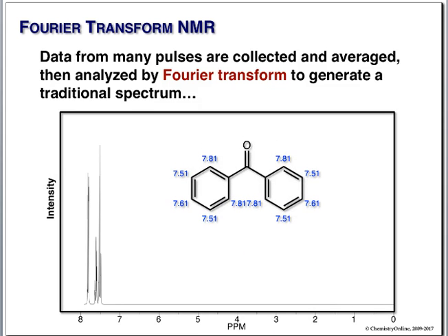These are monosub benzenes. In a continuous wave NMR, they would essentially appear as single peaks, area 5. But the FT allows us to get much more detailed data, and because of that, now you can see all the splitting that goes on, all the peaks. Again, we're not going to do this. We're going to do simple CW NMRs because they're much simpler.